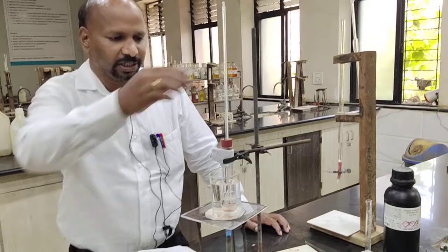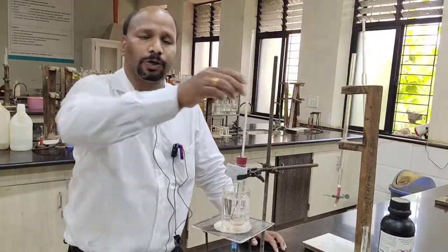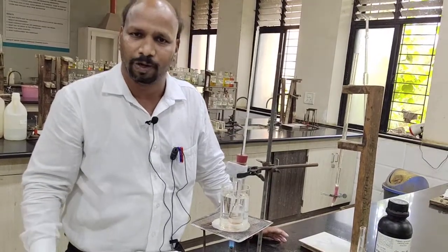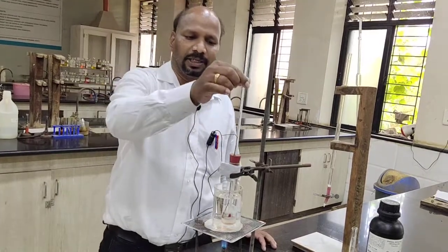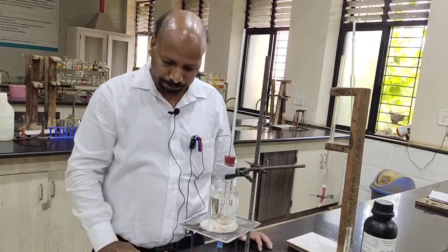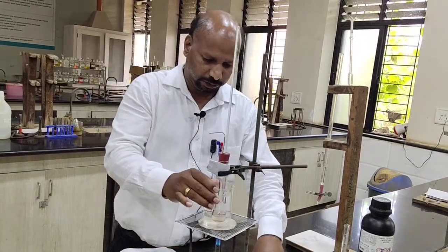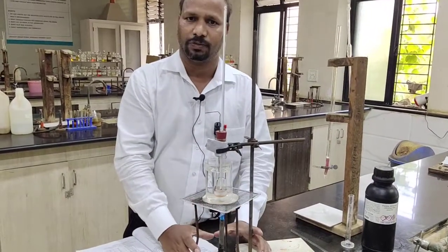So if we see the room temperature, you are not going to say 26 or 27. Its room temperature becomes 26.5, 26.6 like that, because the thermometer is a 1/10 thermometer. Okay, so as shown here, we have to prepare the setup like this.